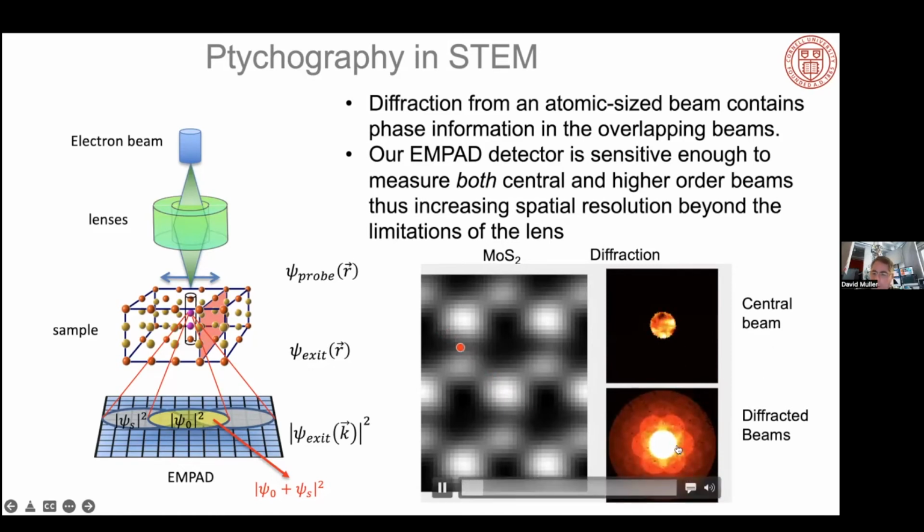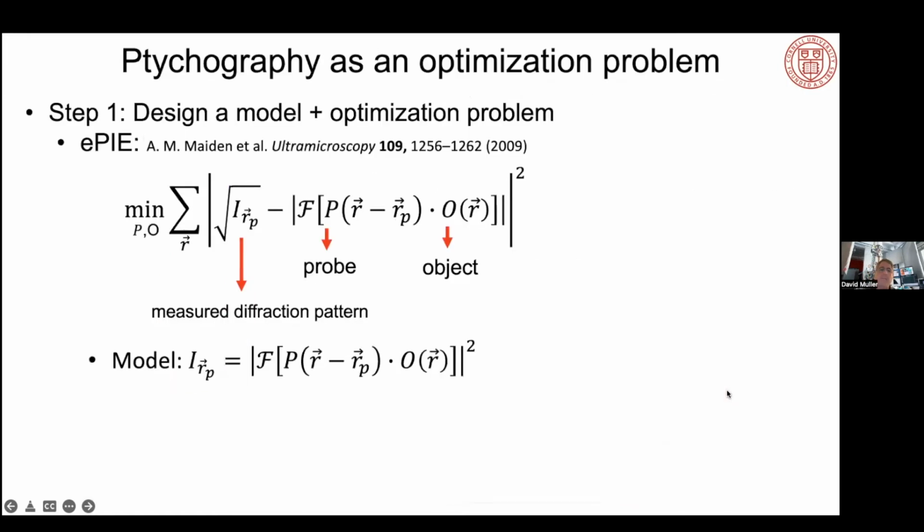What we want to do is solve the phase of this diffraction pattern, and as a function of position, there's rich information to be extracted. And the end result of that is normally our numerical aperture would be this big. That would be setting the resolution. If I can collect counts out to the largest scattering angle on the microscope, I can look for a resolution improvement, which is now maybe 5 times better, because that's my largest scattering angle, in theory at any rate. So that's the idea behind ptychography.